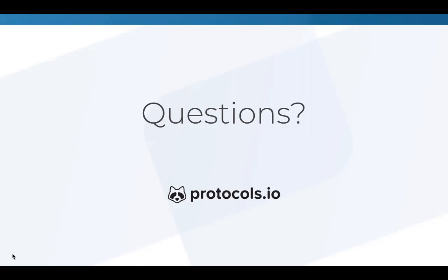Does that answer the question? Not really. My question was, I saw the run tab where you can run and it gives you a checklist of what you need to do in preparation for the experiment. But my question is, you want to copy the protocol. It's like you've read an article and they've given the protocol there and you want to copy and adapt it to suit what you are doing in your lab.